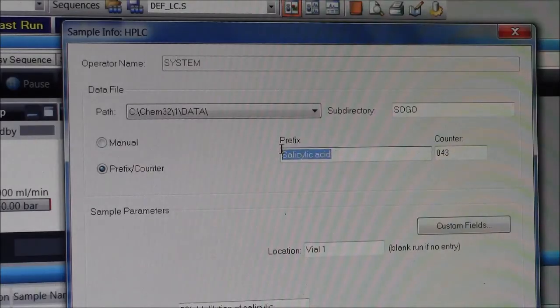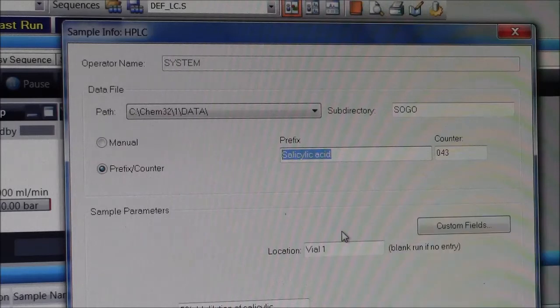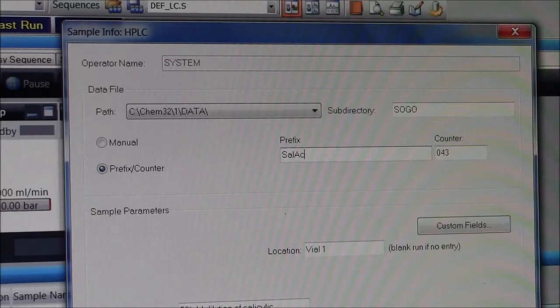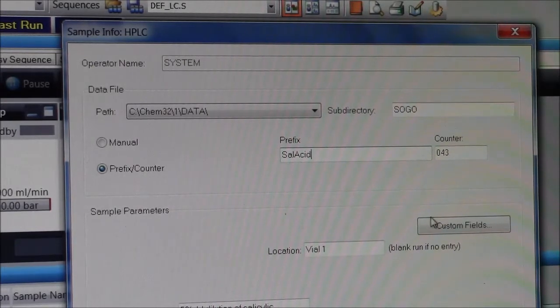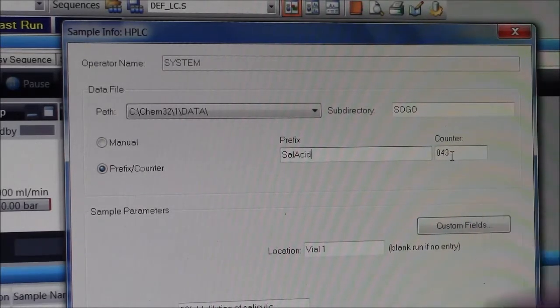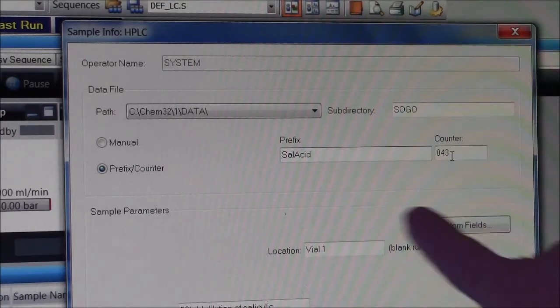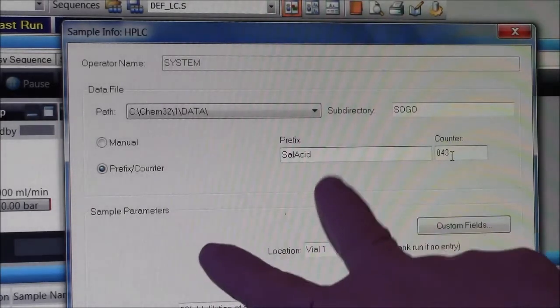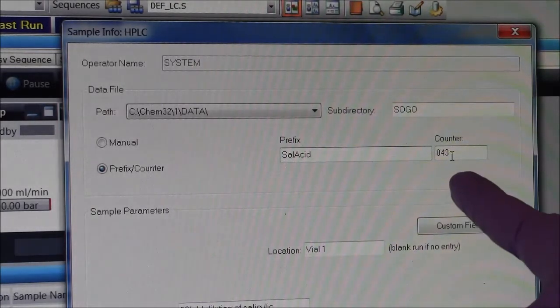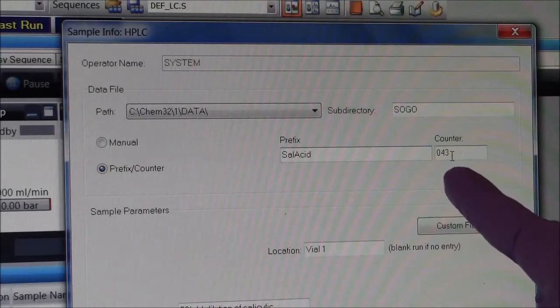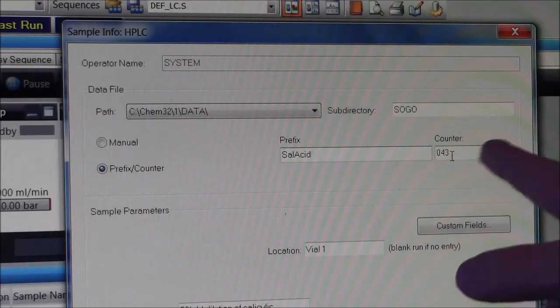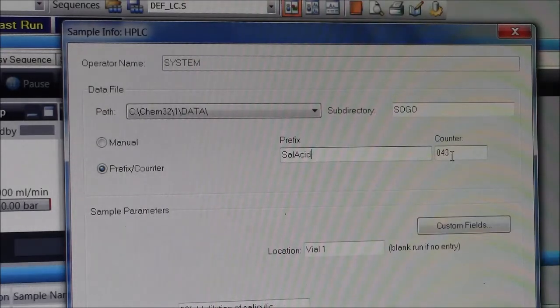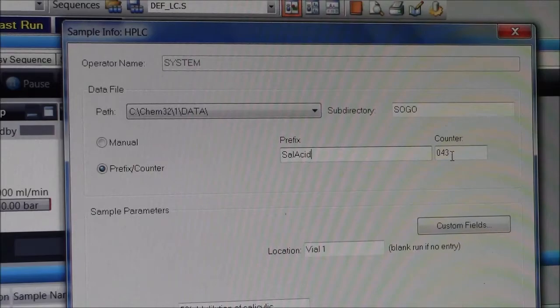I'll give my sample a prefix. It has to be no spaces, something that I'll know what it is. I'll just call it sal acid as my prefix. It has a random number here as a counter, but if I come and use this machine again with the same method, the same prefix, it'll count up. So the next one will be 44, 45, and that way all my old data is saved, not overwritten.